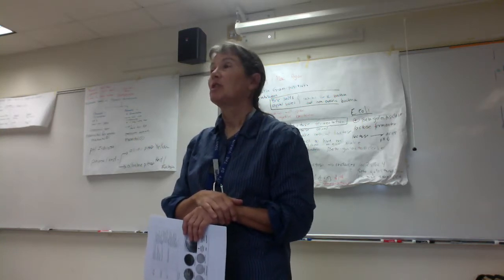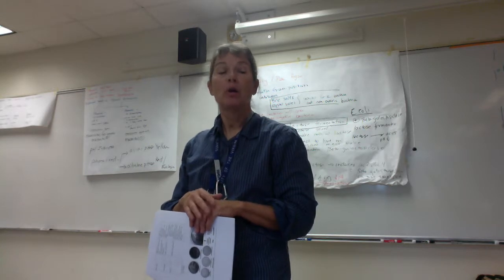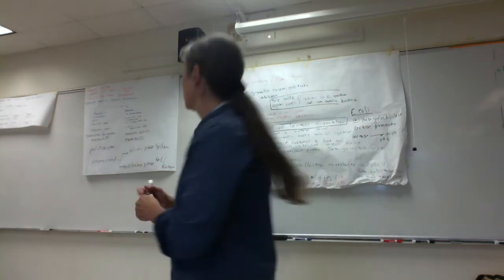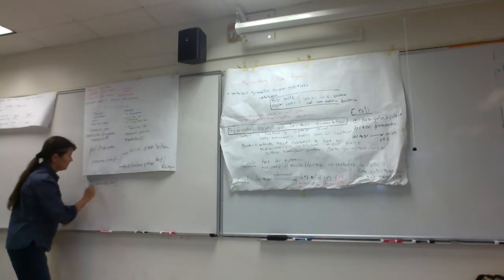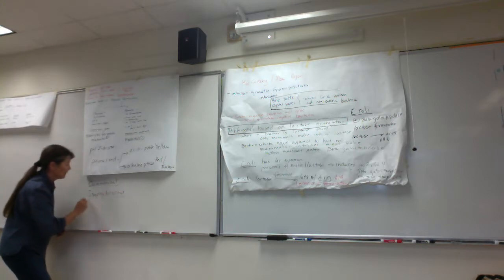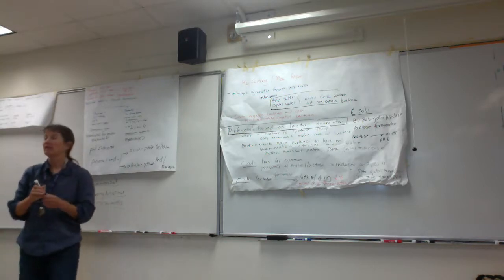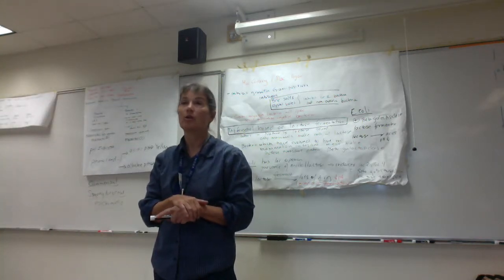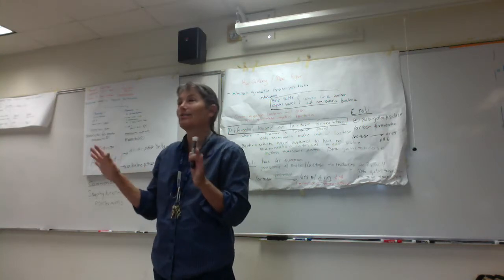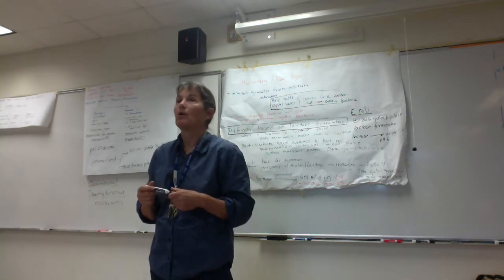And folks, there's two members of the genus Staphylococcus that we might frequently grow on MSA from clinical samples. One of them is called Staphylococcus epidermidis, and this is a commensal. Probably all of us are colonized with it on our skin. So this is a cousin of Staphylococcus aureus. The specific epithet is telling us it lives where? On the skin, right? And usually, unless you're immunocompromised, Staphylococcus epidermidis truly is a commensal, meaning it benefits living on us, but it usually doesn't hurt us, nor do we benefit from it. So we're not that worried about it unless your patient is immunocompromised. As we said, it's a common skin inhabitant, probably of all of us.